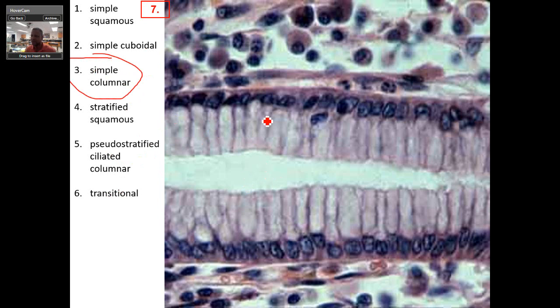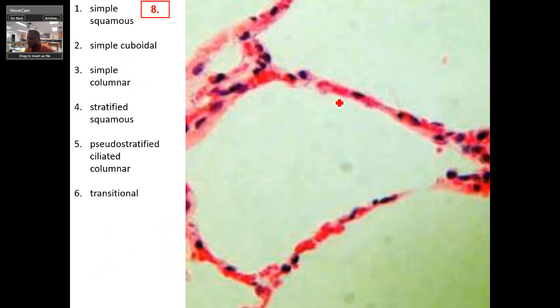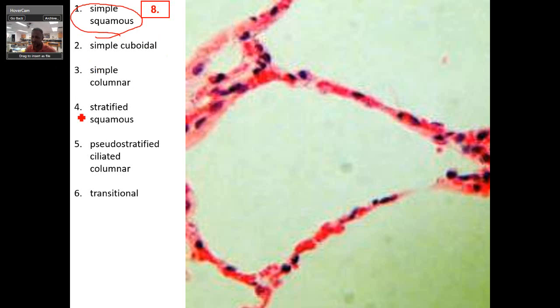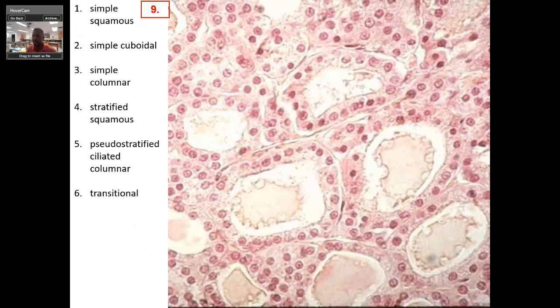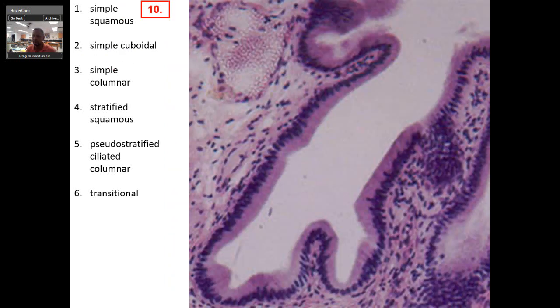There's the lumen. Flat cell liner — this is the opening, this is the lumen. This is probably like a cross-section of an alveolus. That would make this simple squamous — it's another view. You have to look at how you get these shots during the cross-sections. Next — simple cuboidal. And then this is going to be columnar — simple columnar.